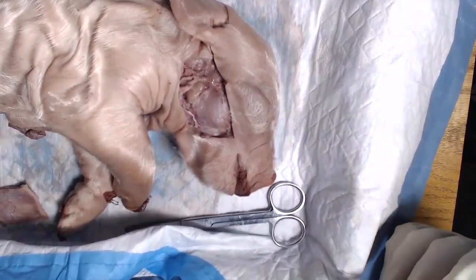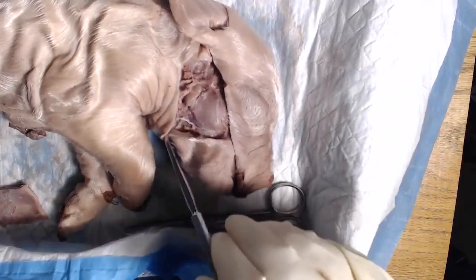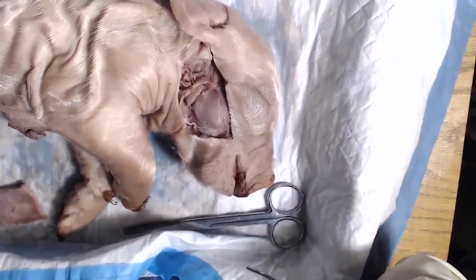I'll go ahead and pause here for a second so that some of you can catch up. Maybe you're still removing some of the skin, or maybe you're identifying the glands. So I'll give you a couple minutes to identify the structures in this view.